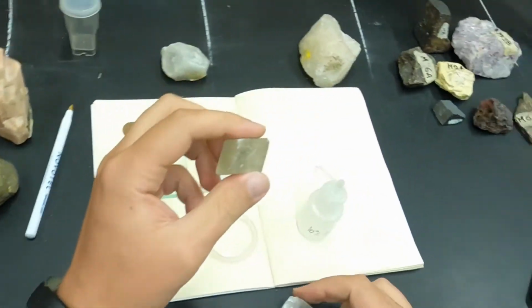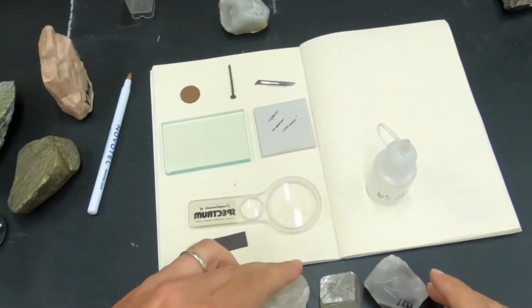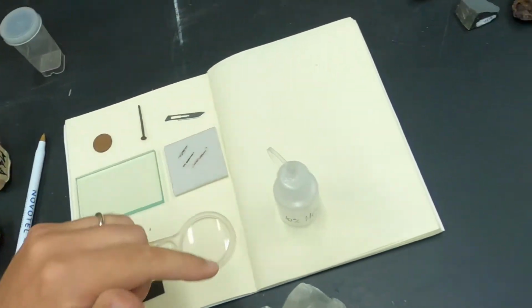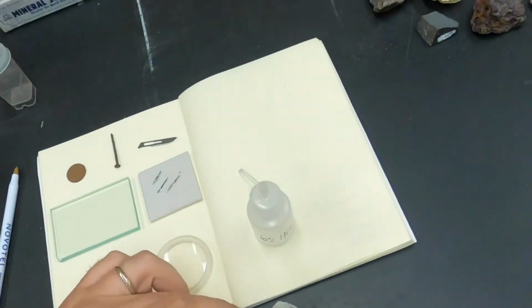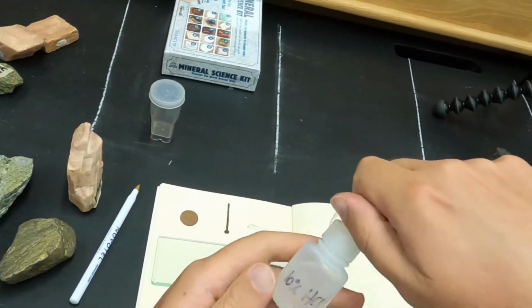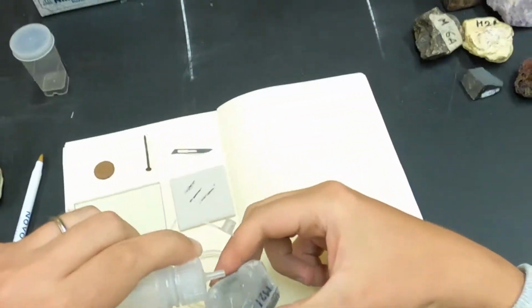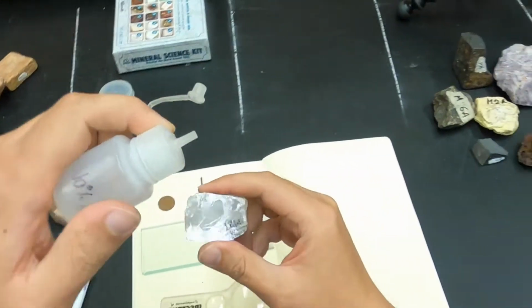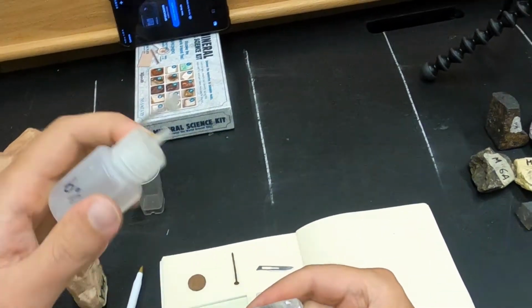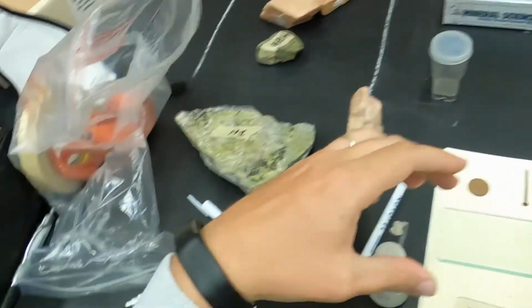Another test you can do, so we could compare quartz and this other mineral, which is fluorite, and calcite. They are all very similar, but they respond differently to acid. The calcite will actually react with acid. Hopefully you can view that, but if I put some acid, you can see a vivid effervescence, and it fizzes.